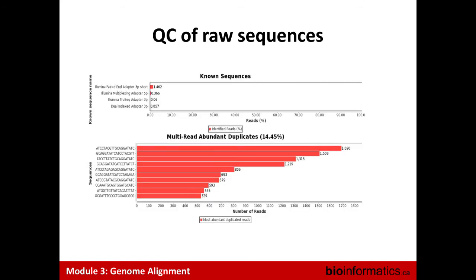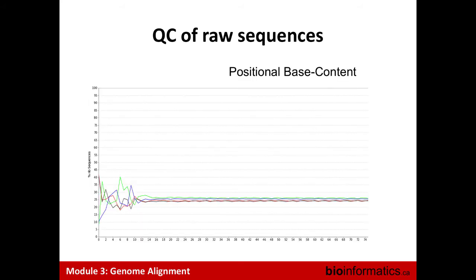So the first pattern is like how you capture the RNA? Yeah. Just to comment, some pipelines remove that, some others do not remove that, because it's a non-random pattern, but it's still genomic sequence. So there's a kind of debate: should we keep it or not? Us, we usually keep it.